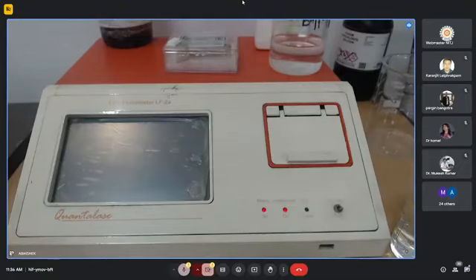So keeping in view this problem, a new fluorimeter was developed in which the conventional nitrogen laser was replaced with a more reliable UV source, an LED, to excite the fluorescence in uranium salt, and that instrument is called the LED fluorimeter. The LED fluorimeter in our lab can measure uranium concentrations from 0.5 microgram per liter to 1000 microgram per liter with a deviation of plus minus 10%.